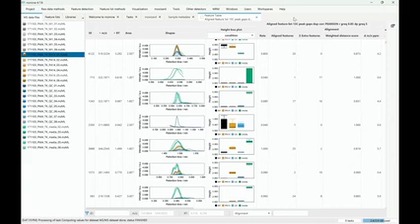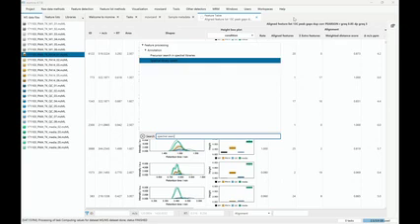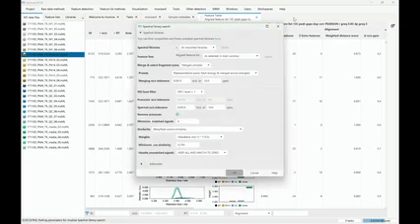Yeah, good question. There's a Kyo. So I just checked the annotation module and found out that currently only cosine similarity is going to be used for the spectral matching against the spectral library, right? So why I'm asking this is I confirm that now we can use multiple different similarity score options for the network building, and then why not DreamMS or the MS2DeepScore for spectral library matching?